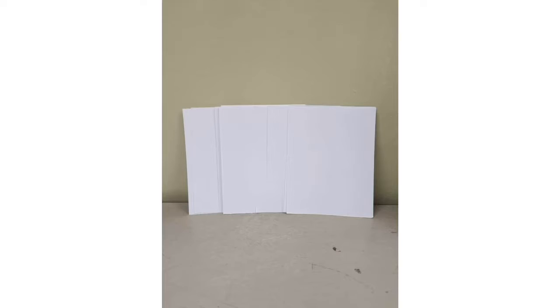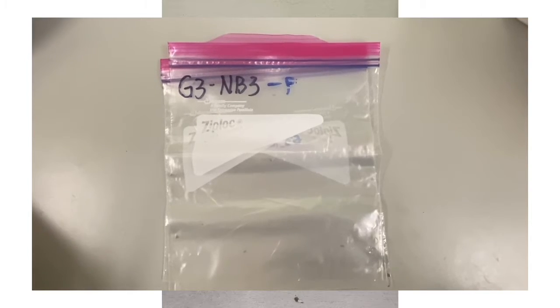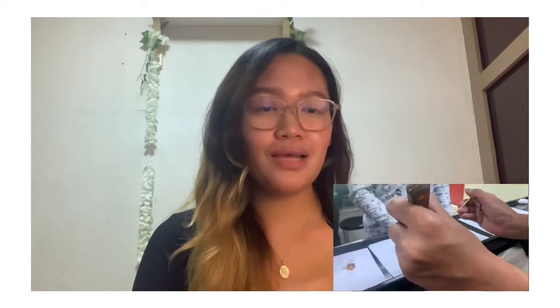We will use a 1/4 sheet of bond paper where the baits such as the peanut butter and tuna will be placed. The insects captured through passive collection will be stored inside the ziploc along with the 1/4 sheet of bond paper. For our baits, we use the peanut butter and the tuna, and these are good choices that will cater to all the nutrients or diets of different insects that we can gather. And these can be placed on the 1/4 sheet of bond paper.